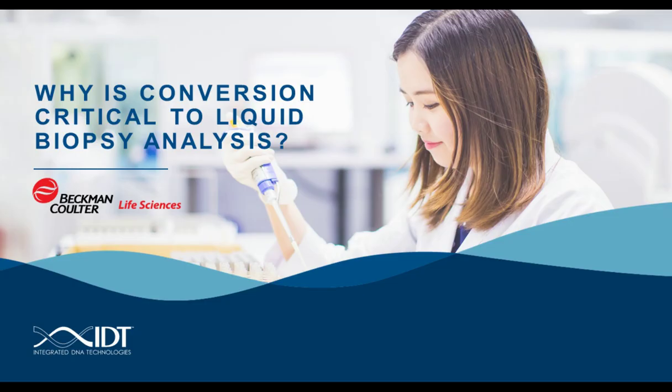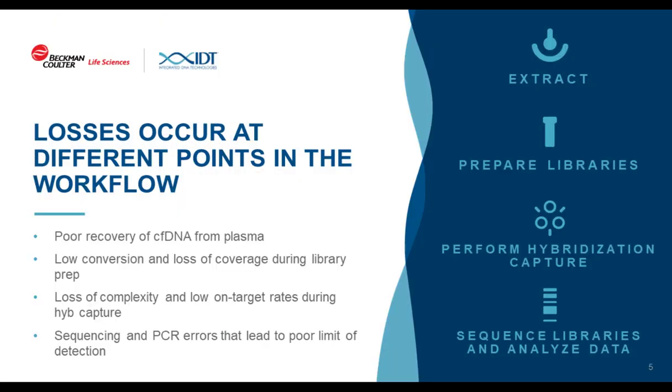Why is conversion critical to liquid biopsy analysis? Conversion is critical because losses can occur at different points in the workflow. You see on the right-hand side in the dark blue, the workflow steps include poor recovery from plasma during extraction, low conversion and loss of coverage during library prep, loss of complexity and low on-target during hybrid capture, and finally, errors that occur during PCR and sequencing.